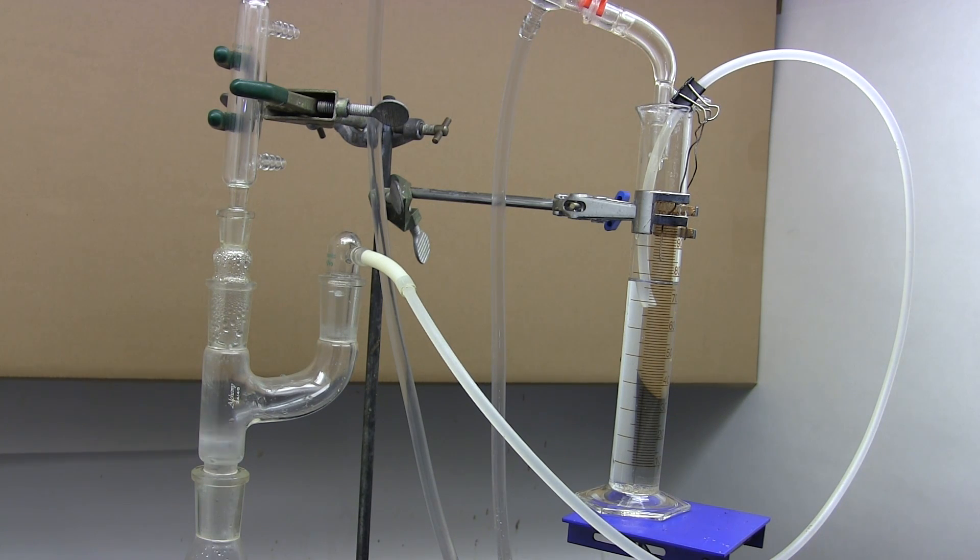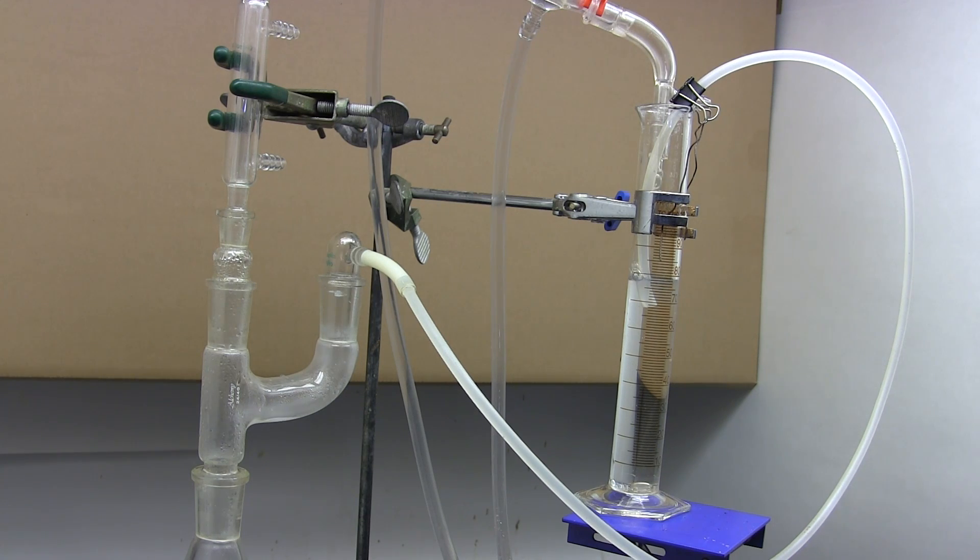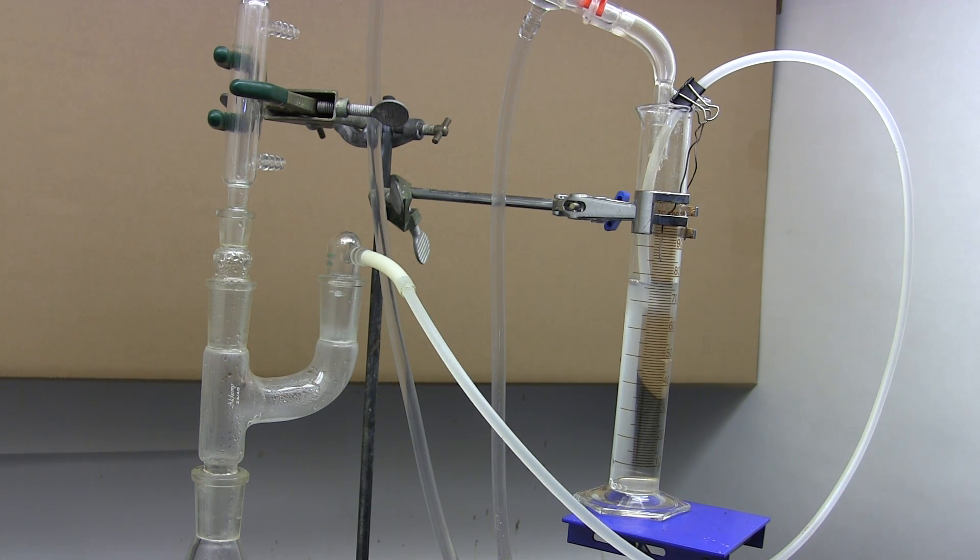And there it goes. First the vapor rises up through the columns and into the condenser. It condenses back into a liquid that phase separates and drips into the graduated cylinder. The heavier water phase sinks to the bottom where it collects. The lighter phase overfills the cylinder and the siphon tube sucks it out and returns it to the boiling flask via the Claisen adapter.